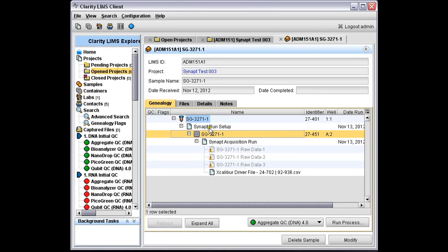So here's the process, there's the input artifacts, there's the output artifacts, and the output artifacts were obviously used as the input artifacts to the second process, this one here. And this produced, this is a more interesting one, this produced 4 outputs, all relating to this single input.